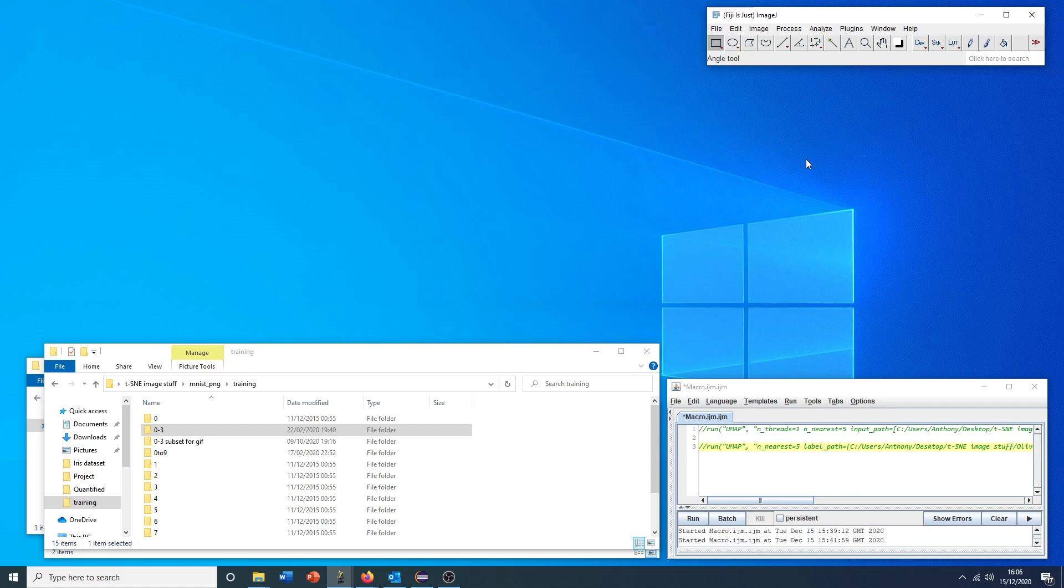Hello, this is a tutorial in the use of the dimensionality reduction plugin for ImageJ or Fiji.